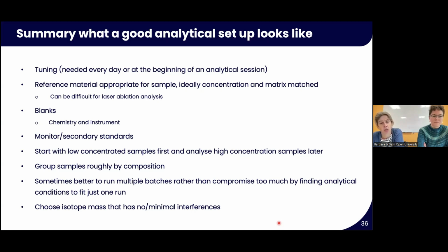Ideally, it's great if you can start with your lower concentrated samples and move to the more highly concentrated samples later on in your analytical session to make sure that there isn't any kind of instrument carryover, although you can monitor for this by running nitric acid samples throughout the sample run.